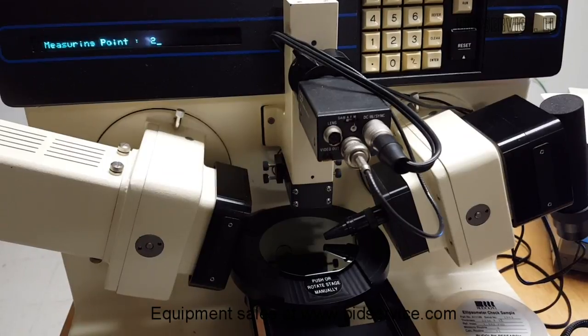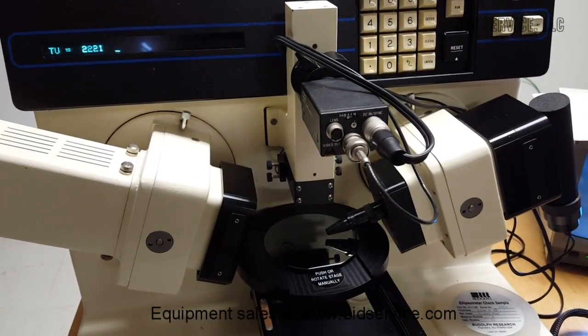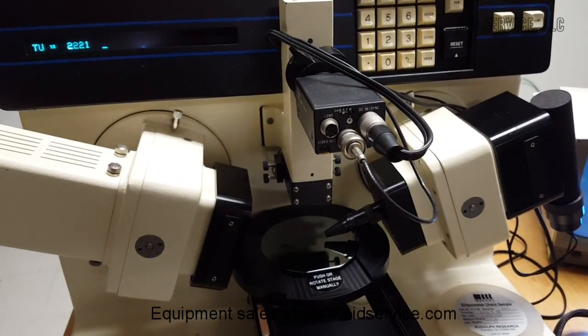It's a pretty used sample, and the measurement repeatability is pretty good.